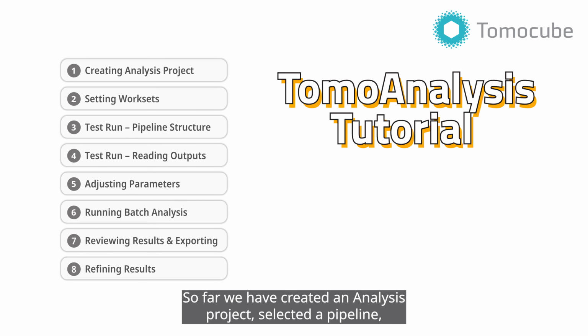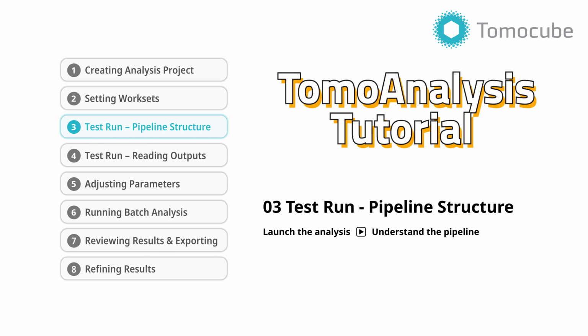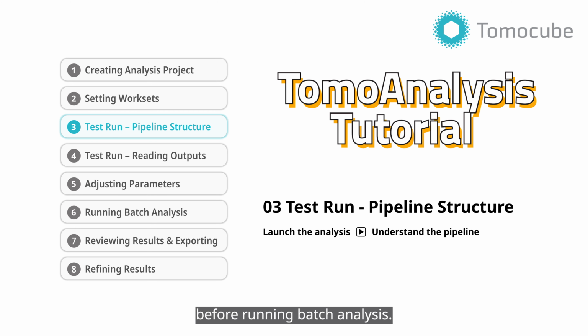So far, we have created an analysis project, selected a pipeline, and set up our worksets. In this video, we'll perform a test run to evaluate segmentation quality before running batch analysis.